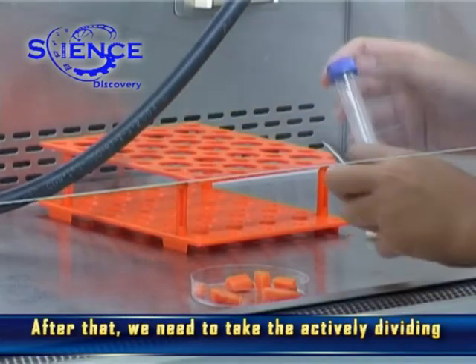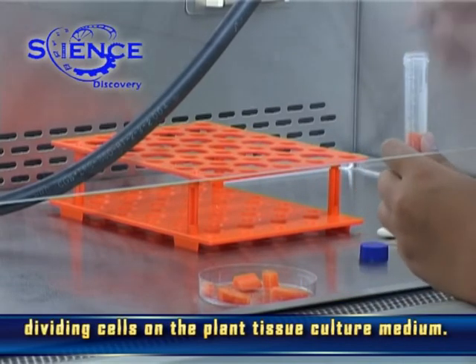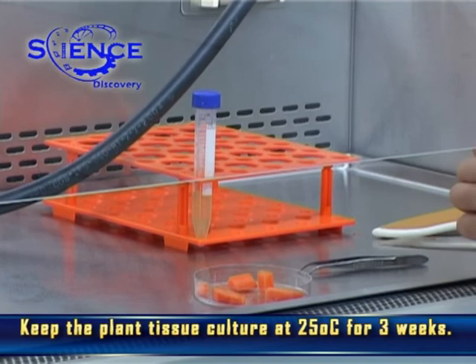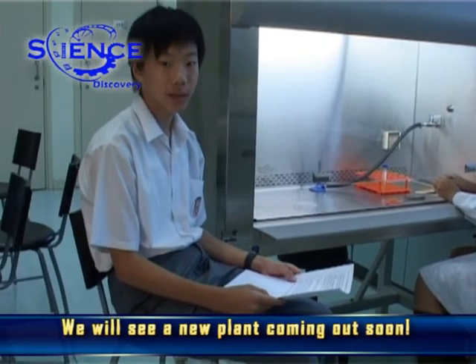After that, we need to take the actively dividing cells as the explant, and then put the actively dividing cells on the plant tissue culture medium. Keep the plant tissue culture at 25 degrees Celsius for three weeks. We will see a new plant coming out soon.